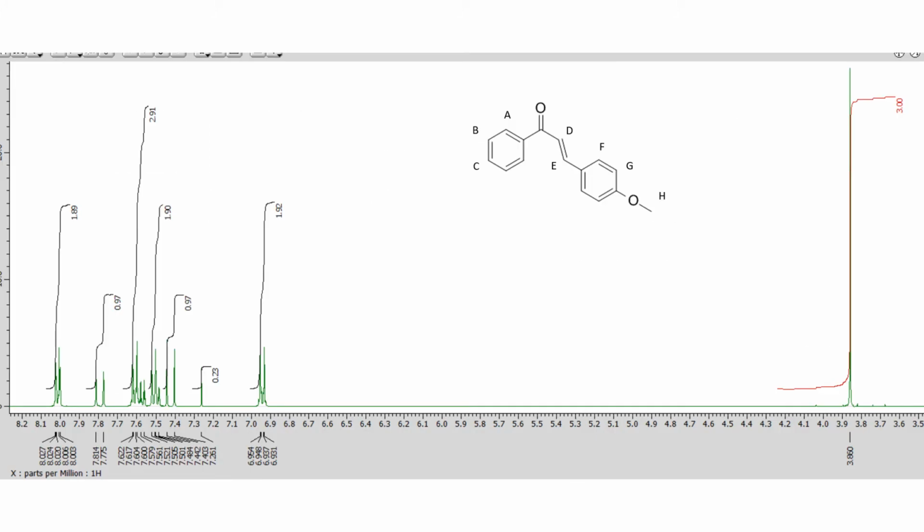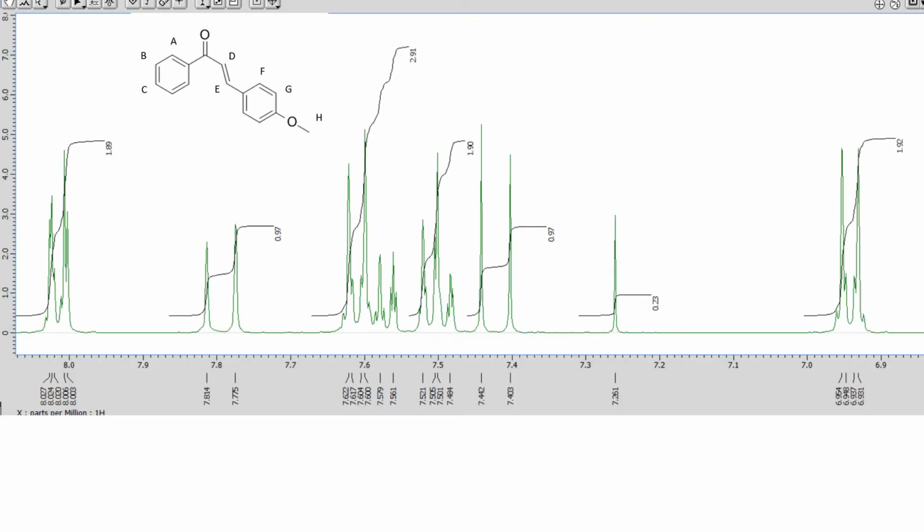Okay, so here is our spectrum. Let's get the easy stuff first. All right, you remember that we've got this side here. These are the sp2 hybridized carbons with the hydrogens, and then this is the sp3 side. And so we can go, all right, we've got one sp3 carbon on here, so those hydrogens are going to show up over here on the right, and if you did your table, you'll see that they're somewhere around 3.8. Perfect. So this is H. Notice it's a methyl group, and it integrates to 3 hydrogens like you should have predicted. Okay, so now we're going to zoom in on this on the next slide so that you can see up close a little bit better.